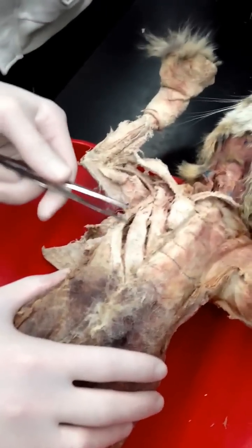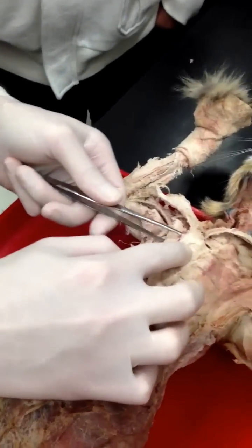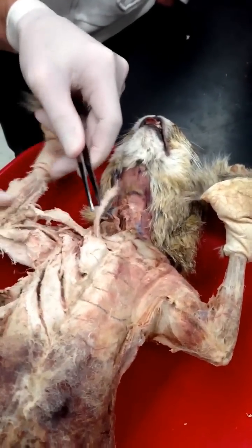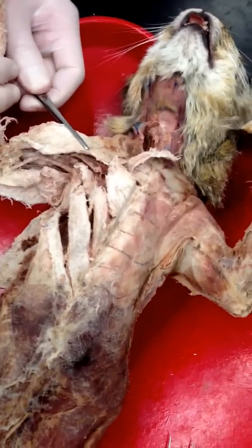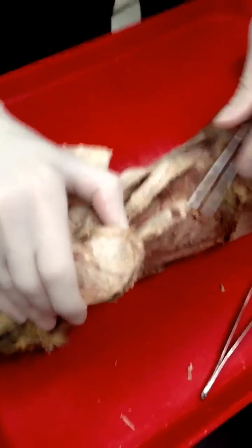Xiphihumeralis, pec minor, pec major — this one's just cut a little weird, but this is pec major. Pecto-antibrachialis, clavicular deltoid, clavobrachialis — or clavodeltoid, I'll accept any label, it's fine. Serratus anterior.